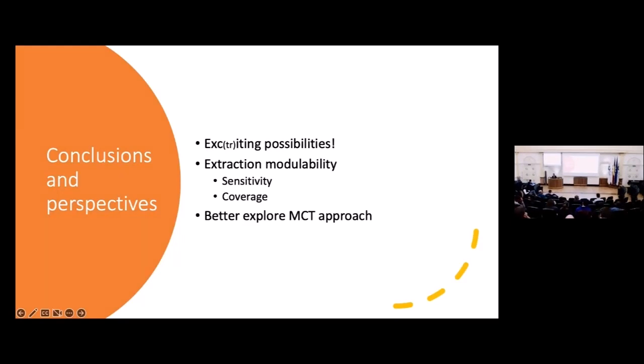We also want to see if we could use the multi-vial multi-cumulative trapping extraction for the contaminant part, since we increase the sensitivity, and we need to study more the impact on non-fatty-based solutions, because Steven worked on fatty-based samples, but here, from what we observe, the behavior is completely different.